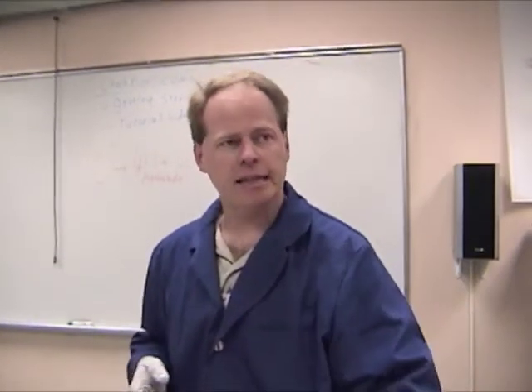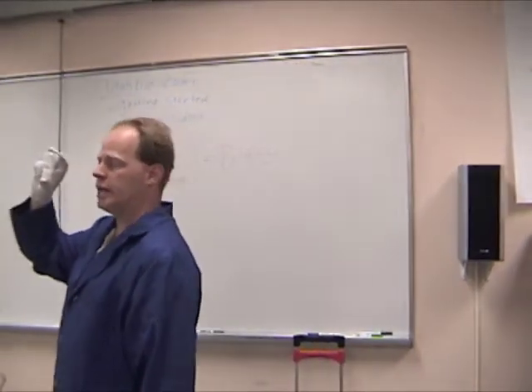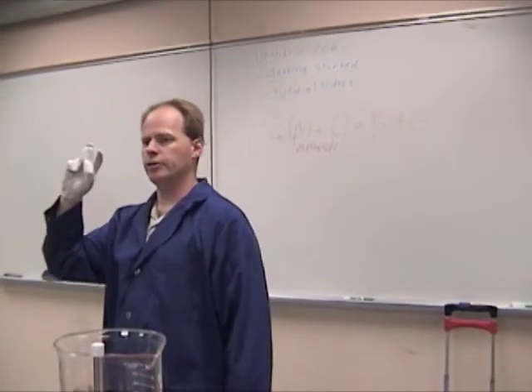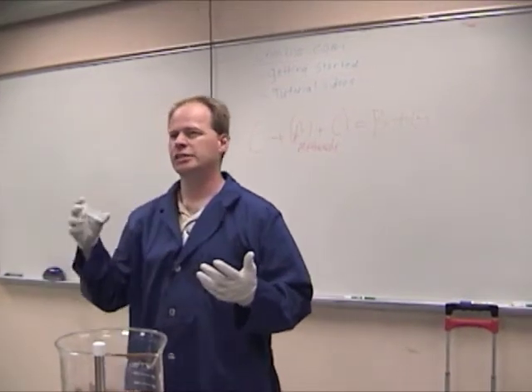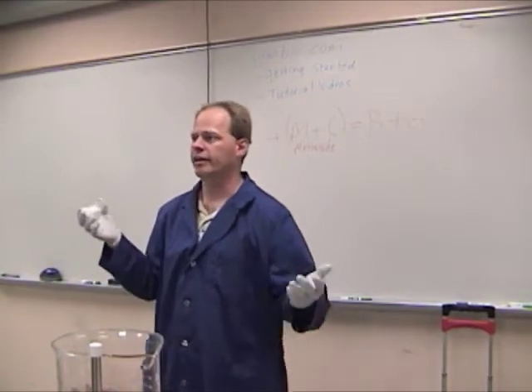You're going to need some catalyst. I would recommend whatever catalyst you plan on using to make your biodiesel, let that also be the catalyst that you do your titrations with. There's some that say that there are conversion factors, and yeah, there are, but it can kind of get messy. So just use the same catalyst you're going to make your biodiesel out of. You got your catalyst anyway.